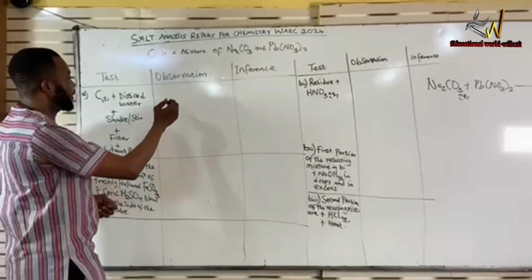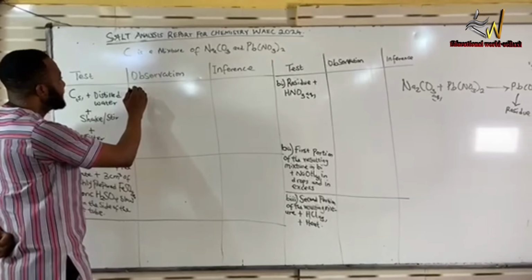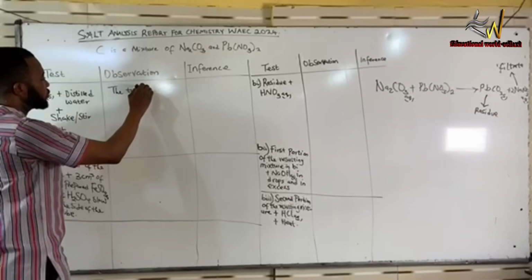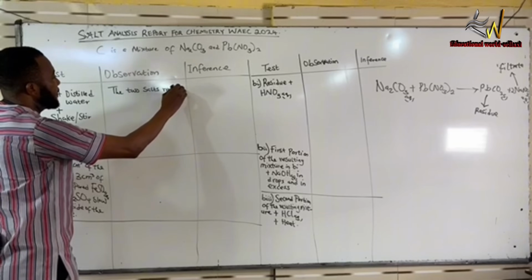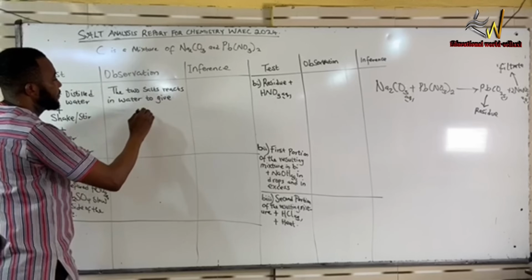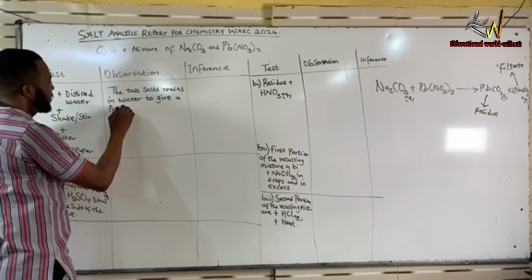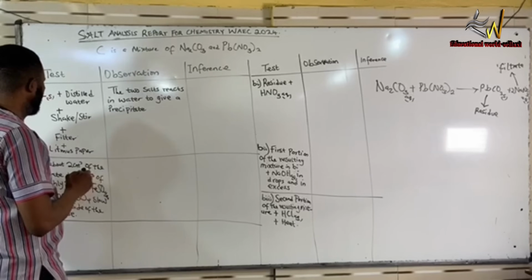So my observation will be: the two salts react in water to give a precipitate. All right.